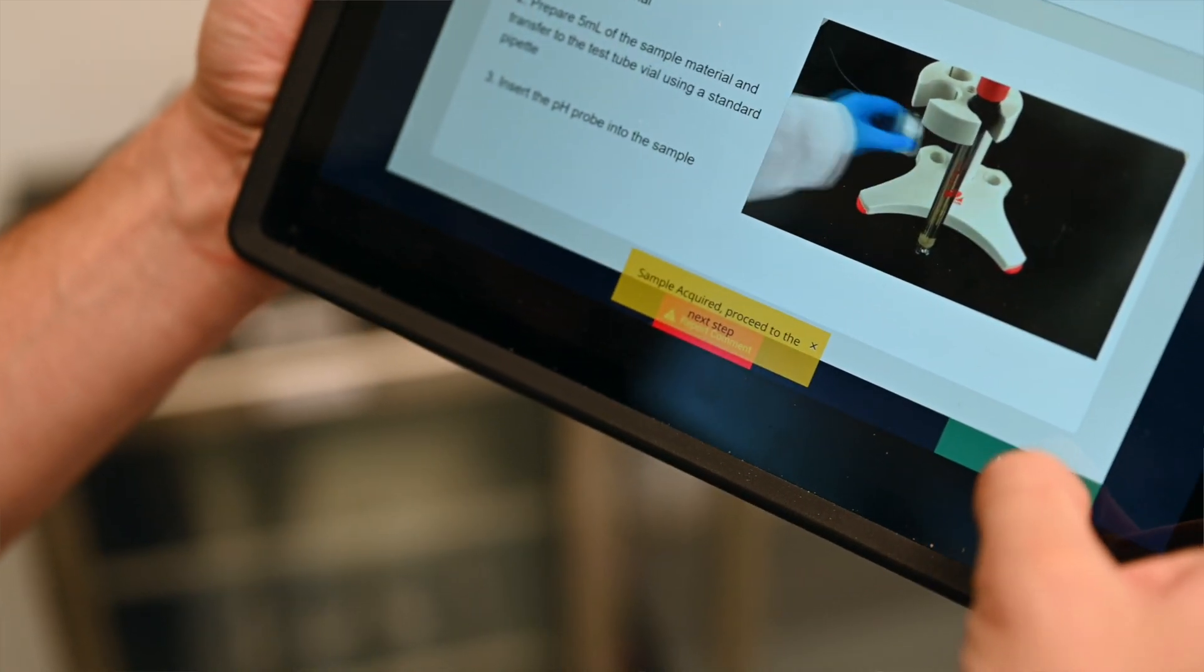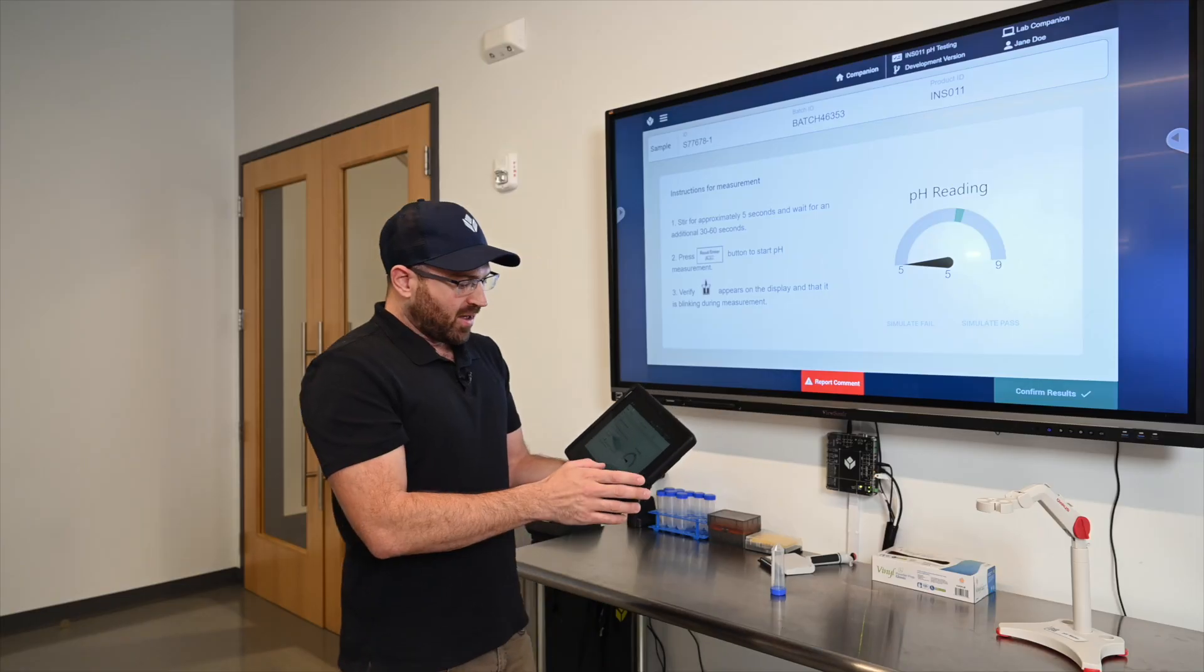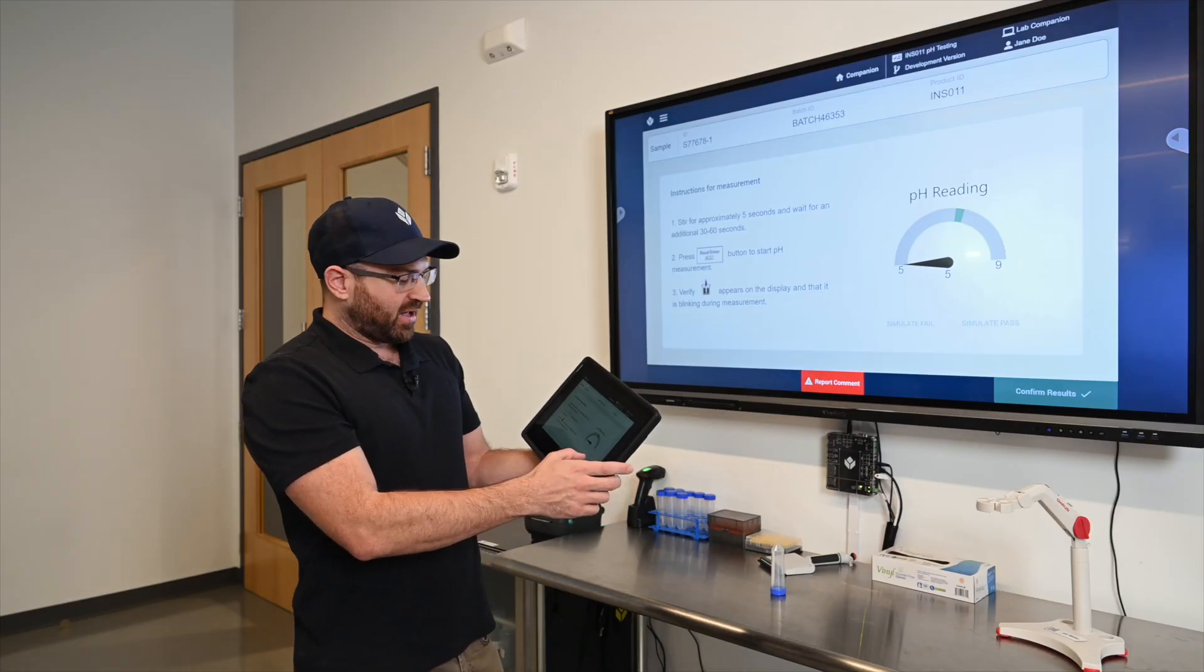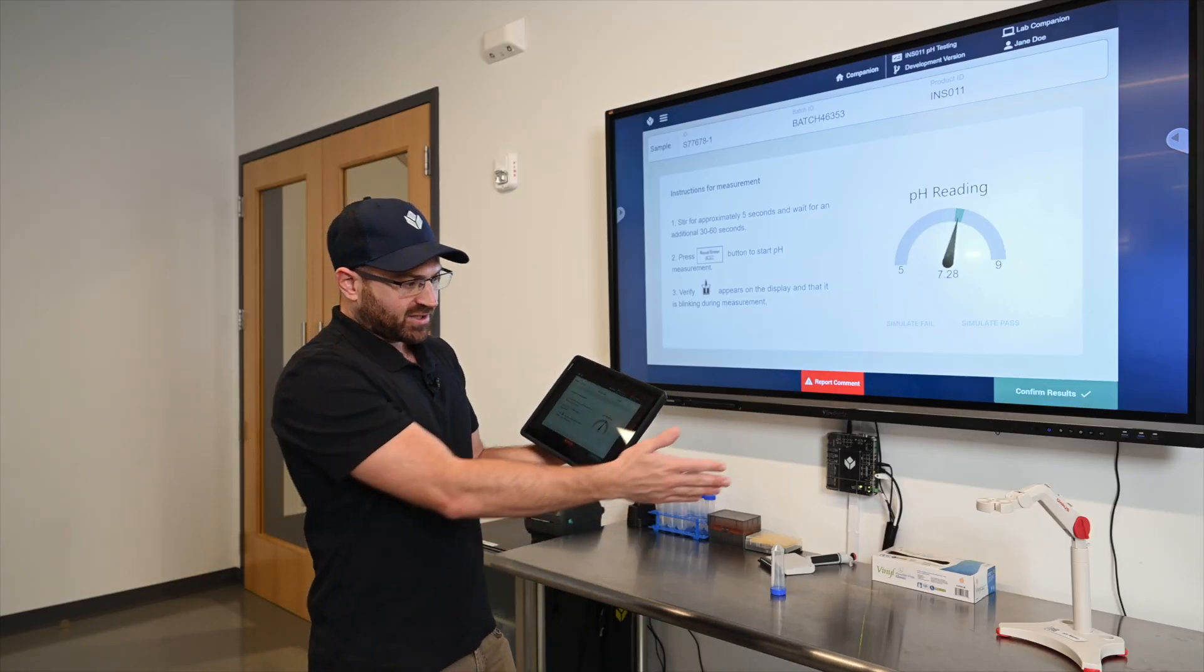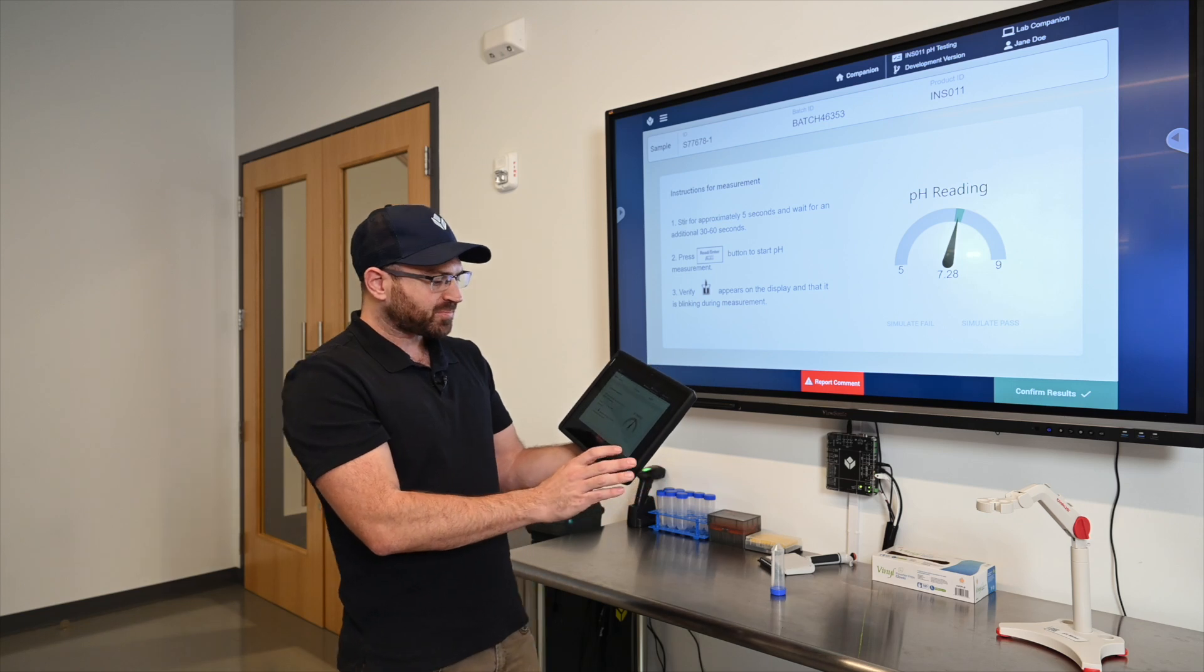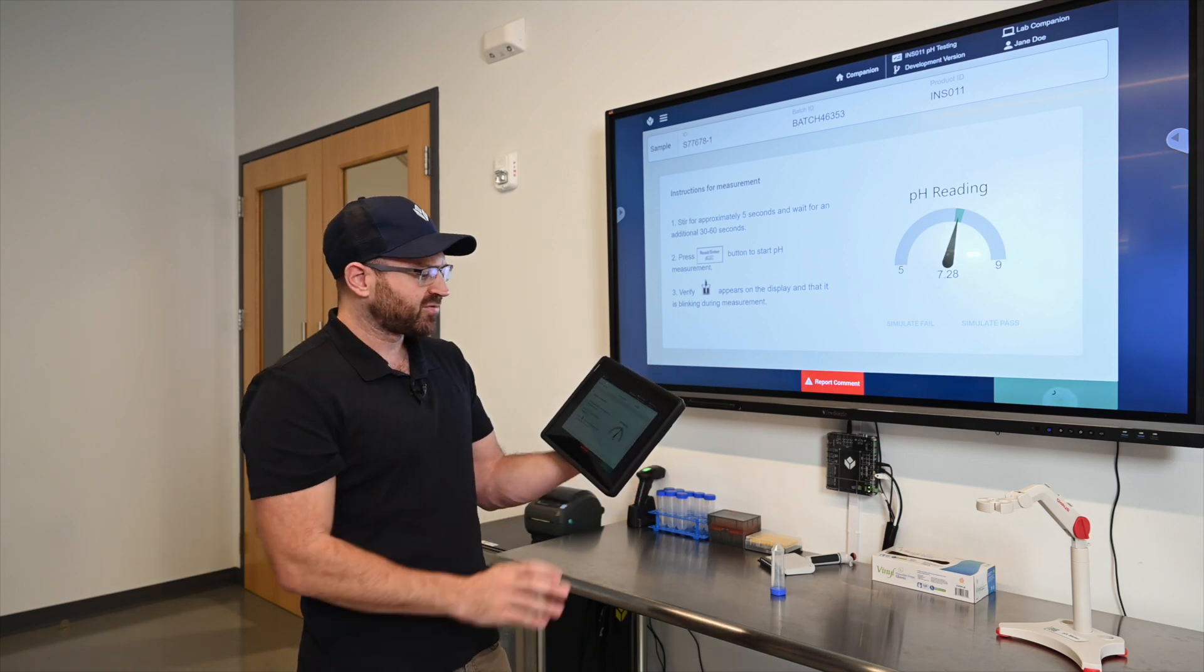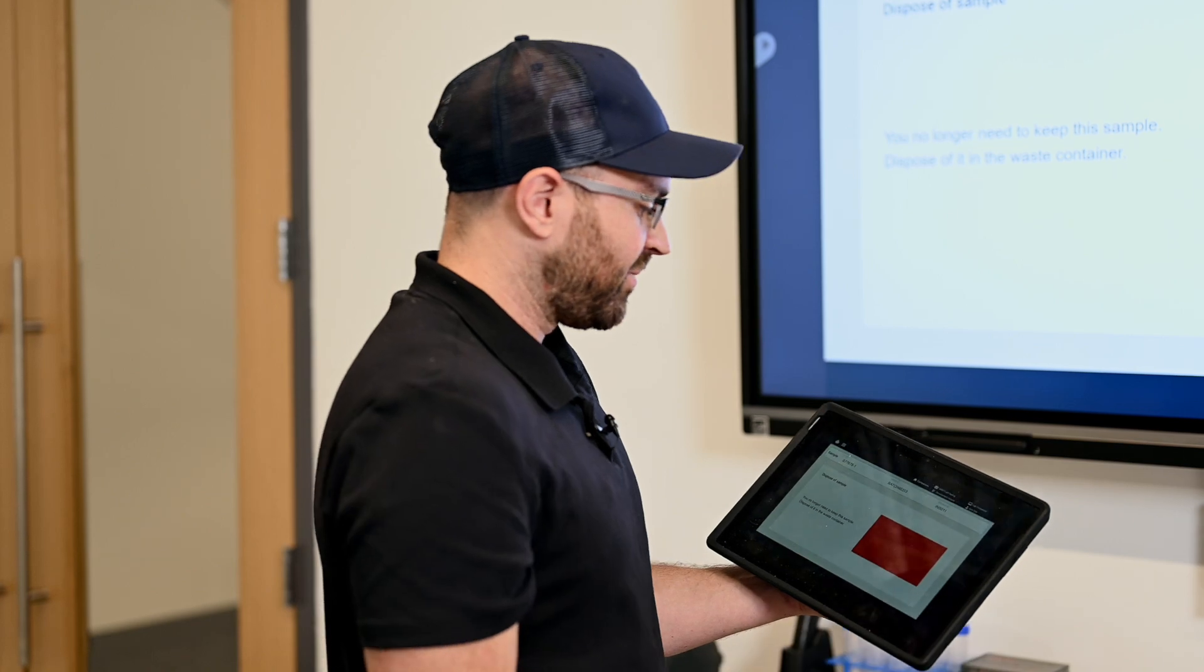I'm going to simulate this as a passing value but I could simulate a fail or I could actually connect directly to the pH meter. Confirm those results. And now that I've got those results I'm going to dispose of the sample.